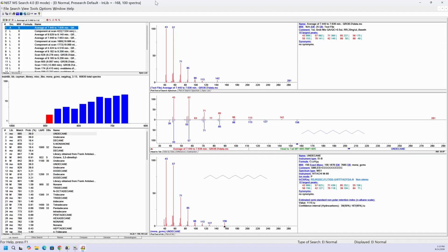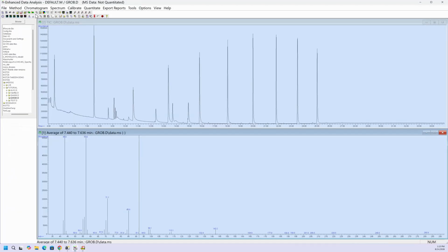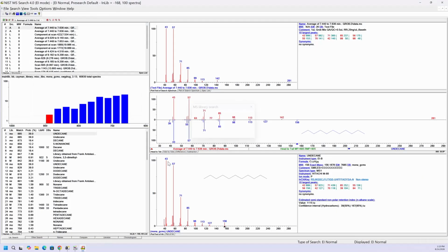So we're all pretty much set up for what we want to do. We'll go back one more time to show you one more feature. Here you can click on this arrow at the top, which says switch to caller. That'll switch you to the program it came from. So we're back there. Again, I'll just double right click and send it again. And you can see it searches fairly quickly, these 60,000 spectra. So that pretty much shows you how it works.